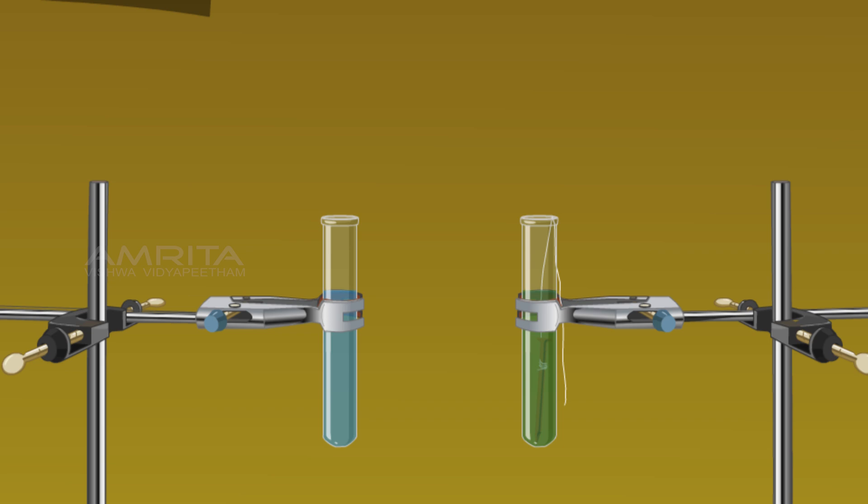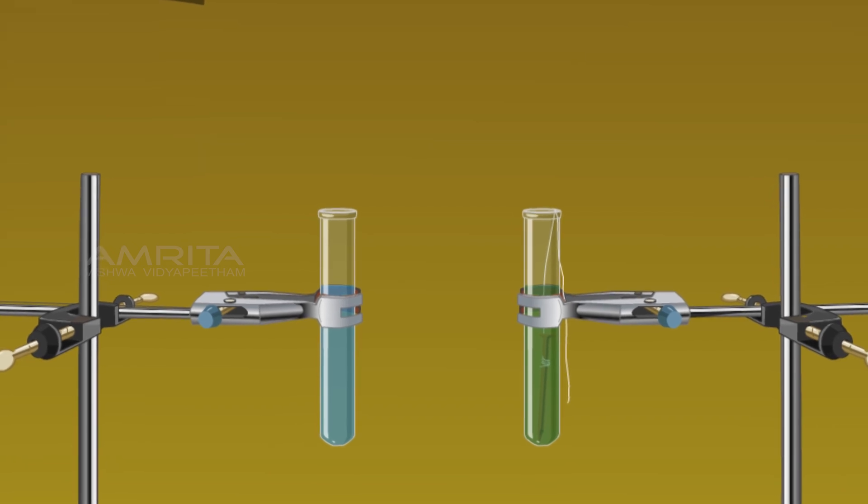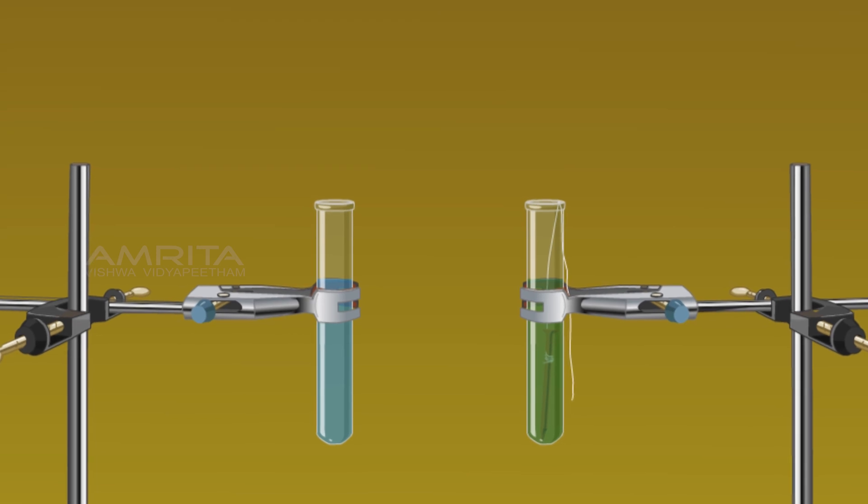After 15 minutes, the colour of the copper sulphate solution containing the iron nail turns light greenish colour. Whereas the colour of the solution in the other test tube does not change.